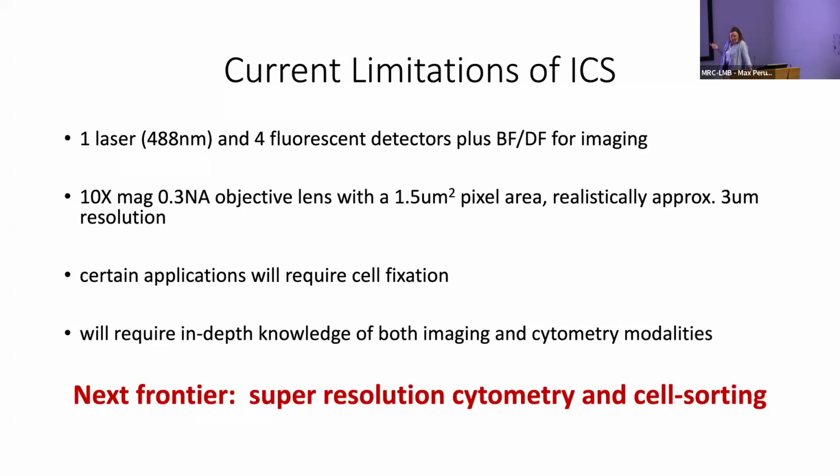It also has other non-imaging lasers. I think it has a violet and a red laser that have a few detectors. If you wanted to actually stain for and get imaging, you only have maybe 1 or 2 detectors off of that that would have fluorophores excited at 488.